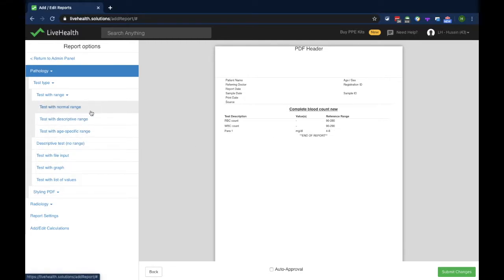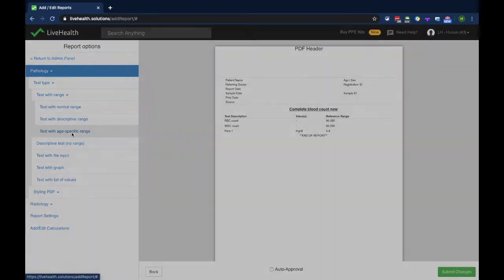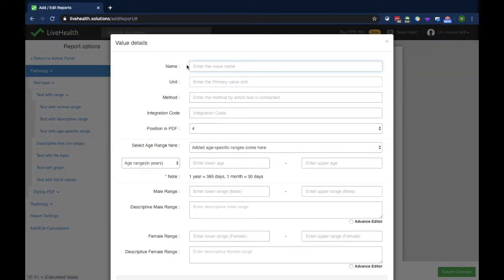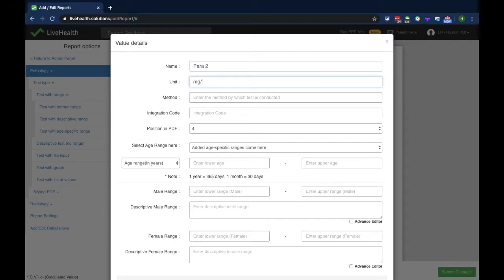Test with age-specific range is used when the reference range changes by age. For example, hemoglobin count changes with age — for children it is different and for adults it is different. In that case you use test with age-specific range. I'll name this parameter 2.